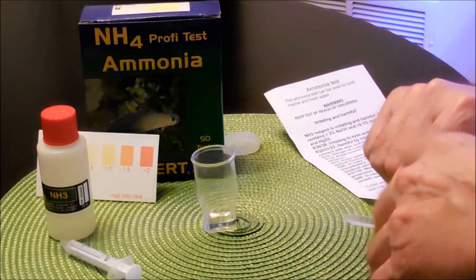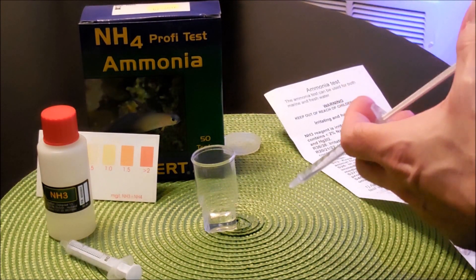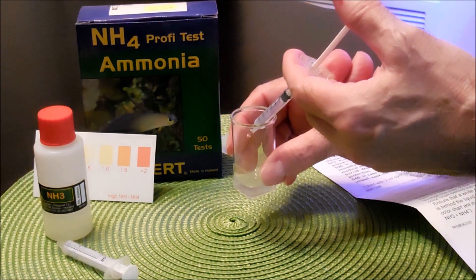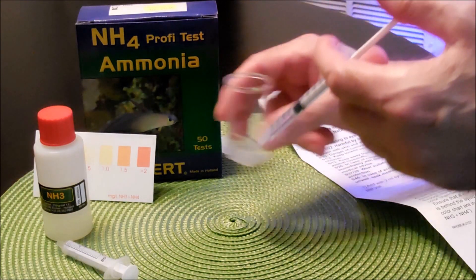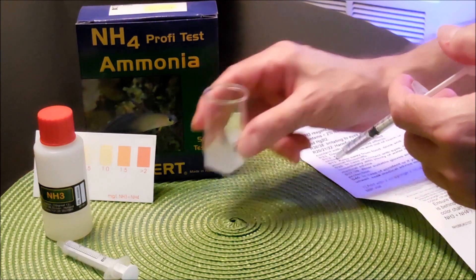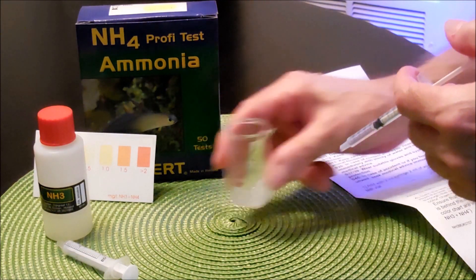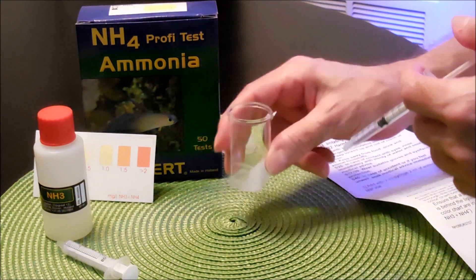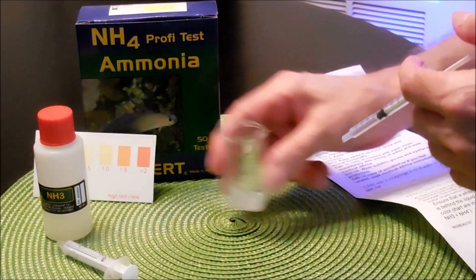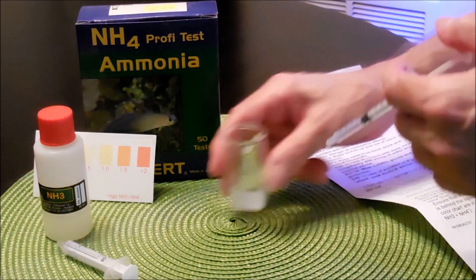It says add 0.5 mL — which would be half — to the test vial and swirl gently for 30 seconds. So we're going to go ahead and add half of it. We're going to swirl for 30 seconds: 1, 2, 3, 4, 5, 6, 7, 8, 9, 10, 11, 12, 13, 14, 15, 16, 17, 18, 19, 20, 21, 22, 23, 24, 25, 26, 27, 28, 29, 30.